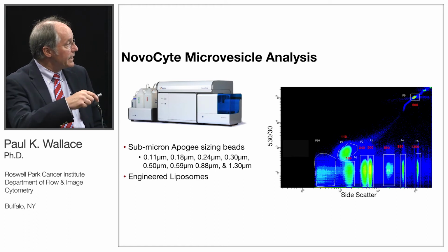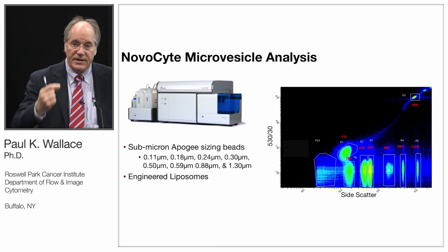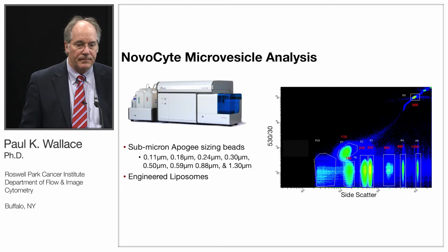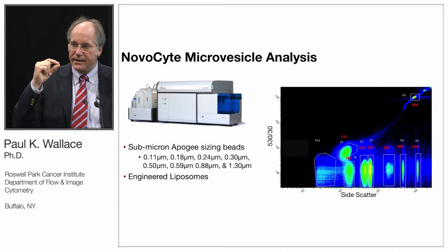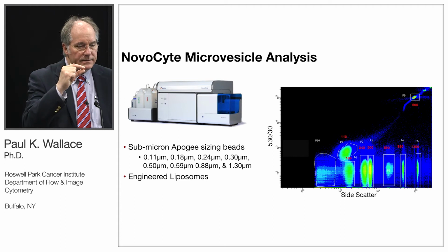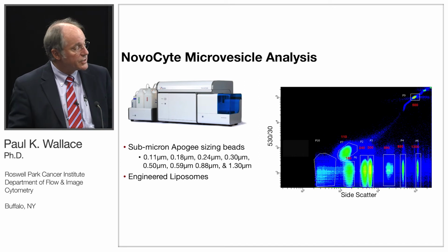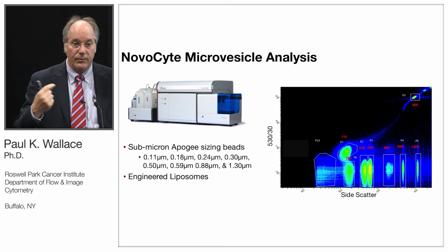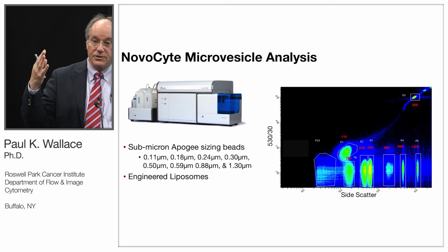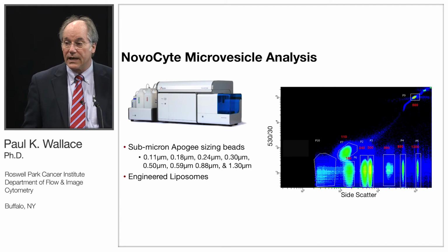What I'd really like to do, and what we've been exploring, is vesicles that are being produced by a cell line that has GFP in it, so we can then clearly detect that this is a vesicle. It's not noise that's in the instrument. And then looking at different dyes, and for that we've been playing around with CellTrace dyes, which work very well as the more lipophilic dyes.